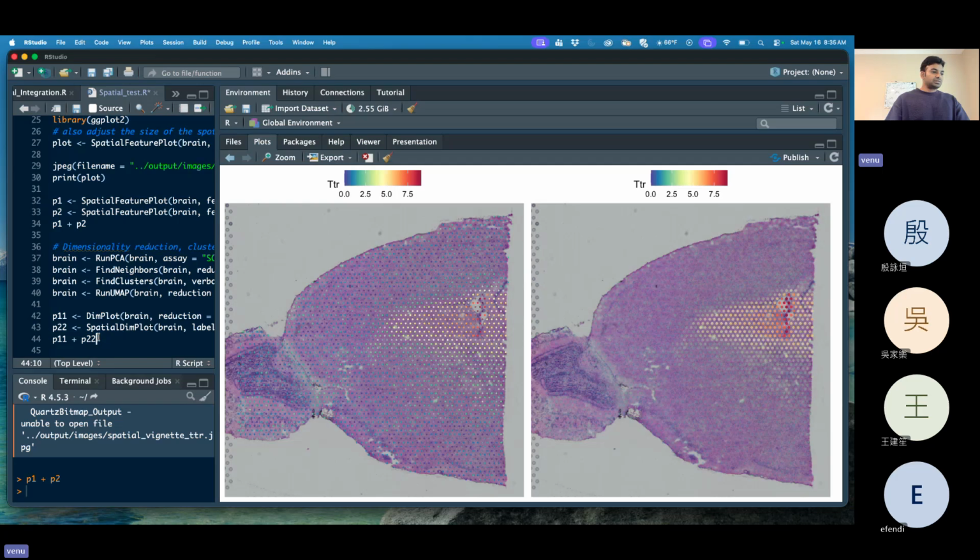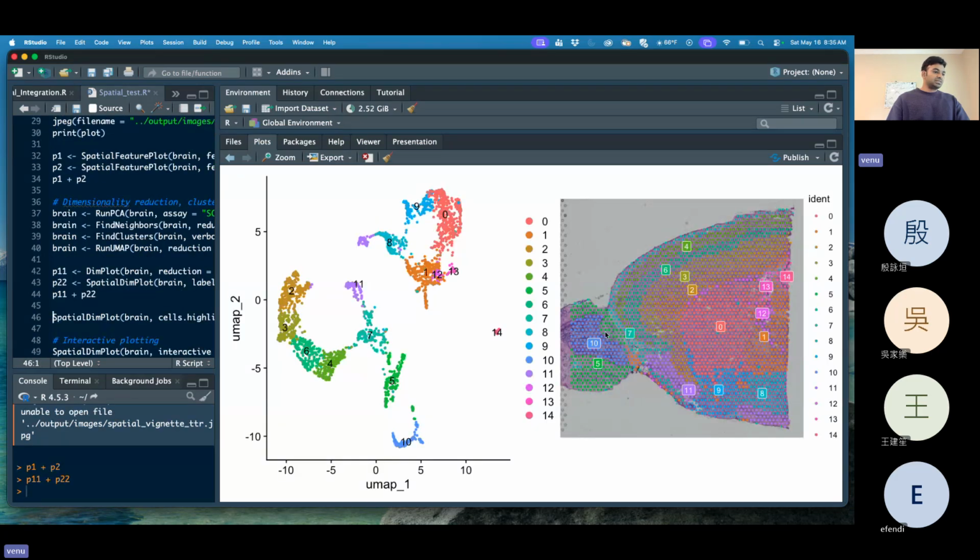Then our next information is this. Here we found neighbors, marker genes and clusters. We first separate the PCs, neighbors, marker genes and clusters. Now we transform this information into UMAP. UMAP is a very nice way to understand the spots. Here we can say spot level, right? A group of spots based on their expressions.